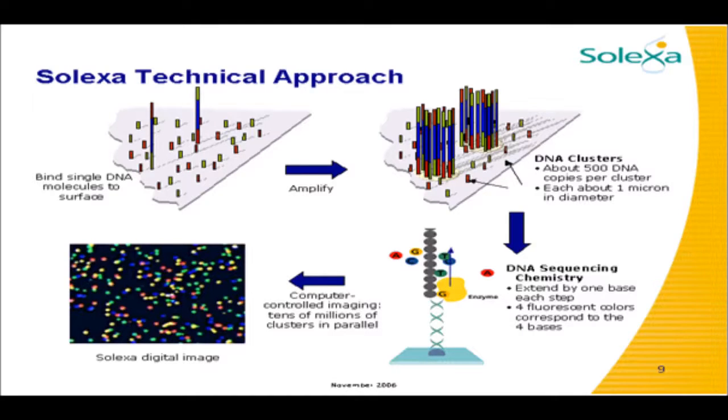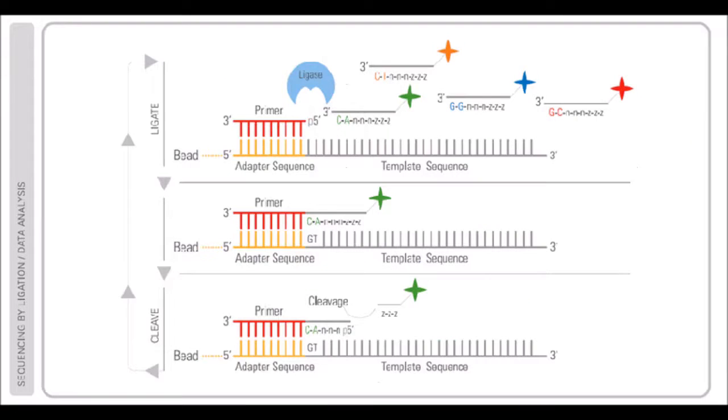The DNA polymerase produces fragments that are ligated to adapters at both ends. Those adapters are considered as primers. This method is based upon the ligation and subsequent steps. The fragments of DNA are ligated to adapters and bound to beads. The amplification of DNA fragments is achieved through emulsion PCR. The DNA denaturation occurs. We add a ligation mixture after we use a primer.